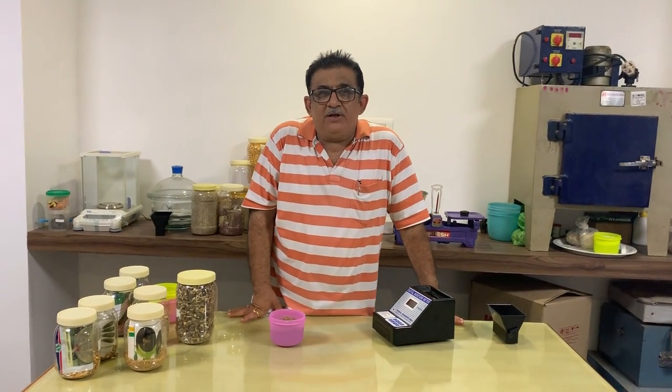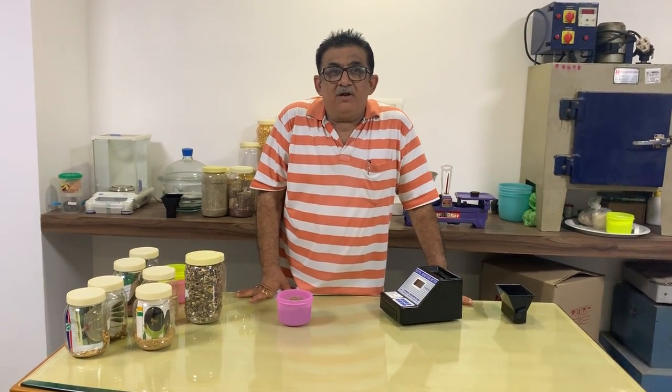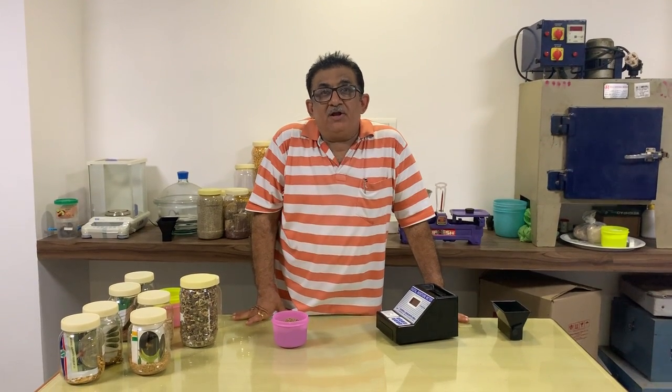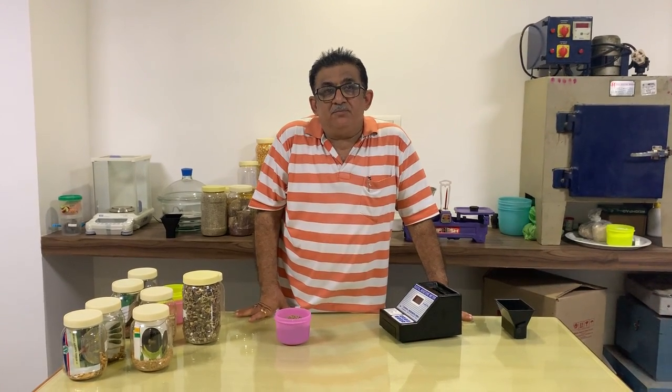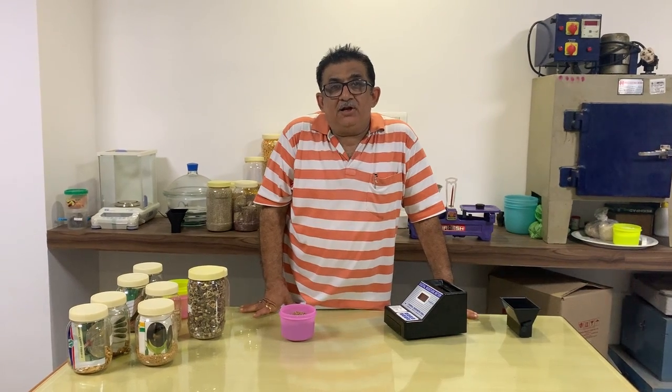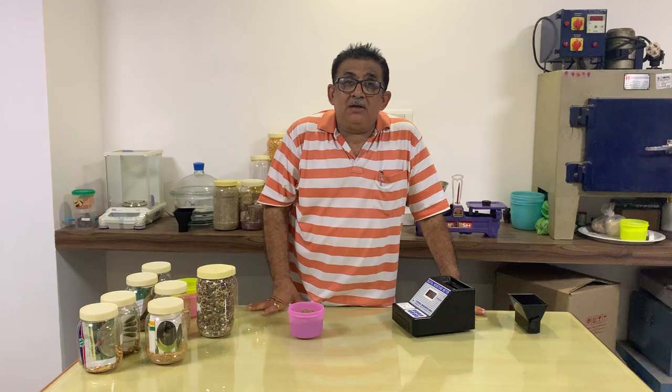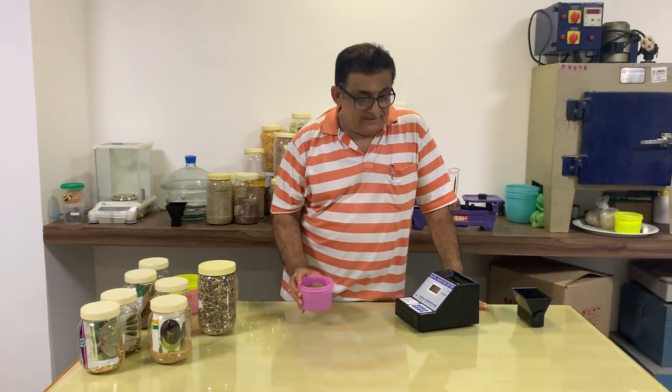Welcome to Nice Friends of India. Today we will demonstrate how to measure moisture content in cluster beans, also known as Guar seed. In Hindi we call it Guar, and in Gujarati we also call it Guar seed.